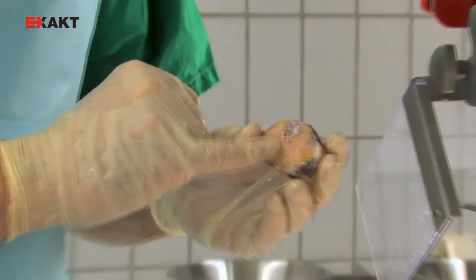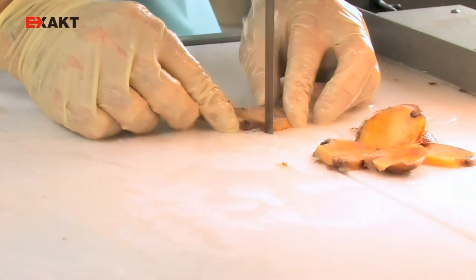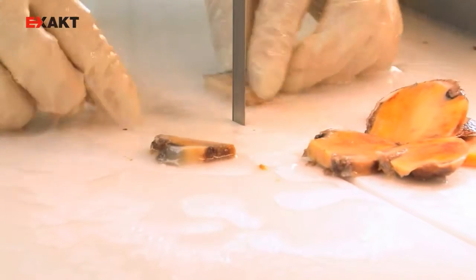This is a so-called detritus cyst in a femoral head specimen. I can now very easily remove it from the specimen so that we can obtain a small block-shaped sample from it.